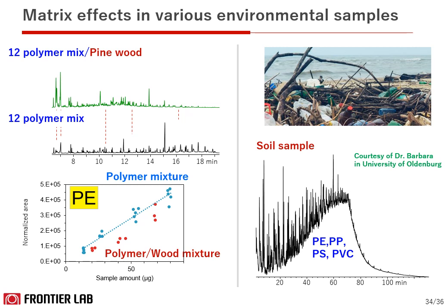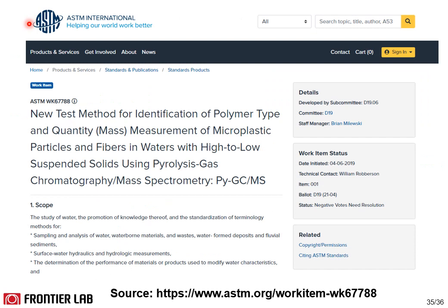You can see the importance of sample pre-treatment before analysis to obtain a good chromatographic peak shape and suppress secondary reactions among samples. There has been a standardized method under discussion in ASTM. If you are interested in microplastic analysis, this may be a good reference for your future work.